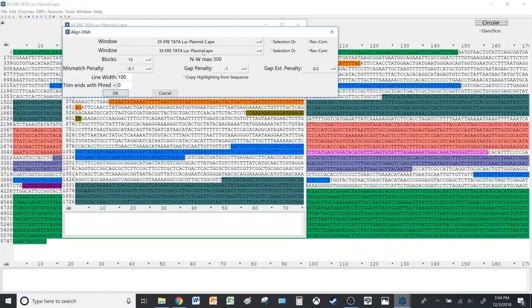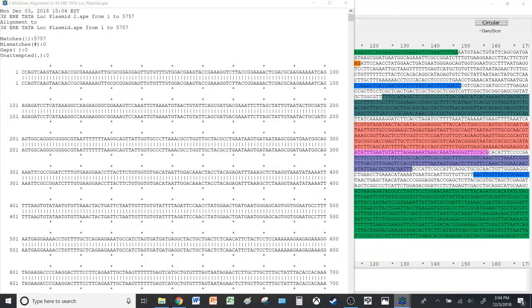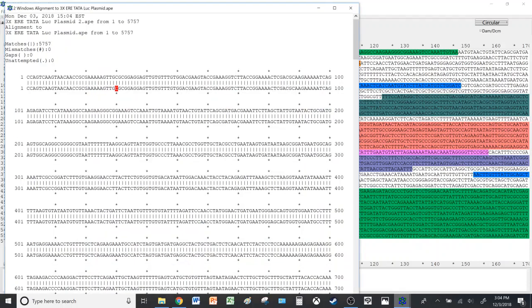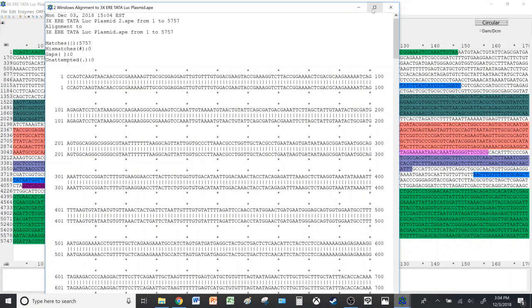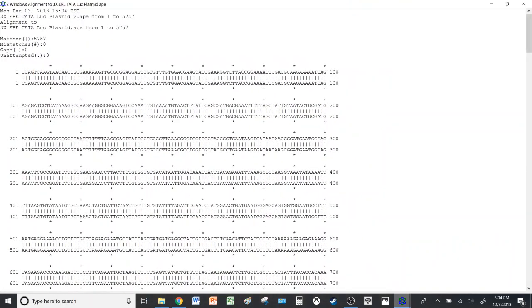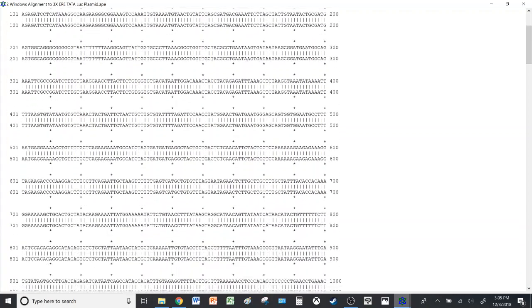And you get this diagram that shows you the top part of one plasmid or one sequence, and the bottom lane is the sequence of the other plasmid. And then it compares it to identify mismatching.